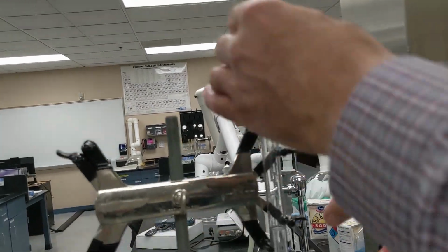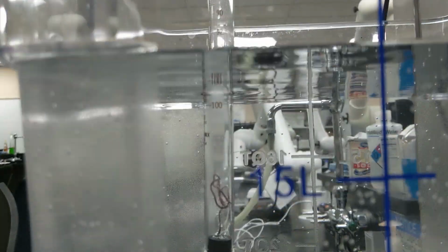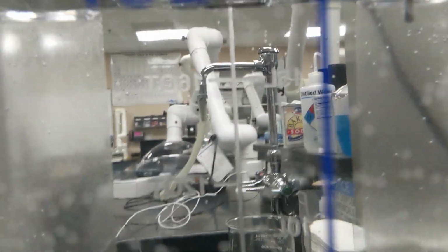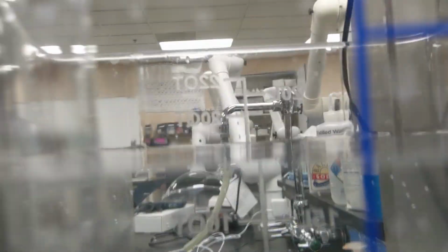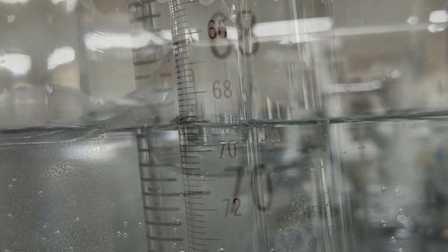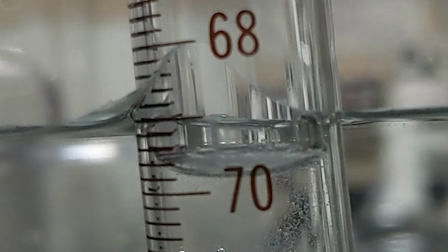Okay, so the reaction's completed. The next thing for us to do is to equilibrate the pressure and take our volume measurement. So I'm moving it slightly below the water level so you can see the meniscus. Beautiful.